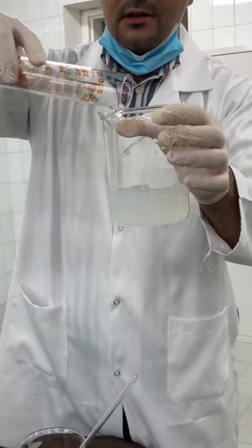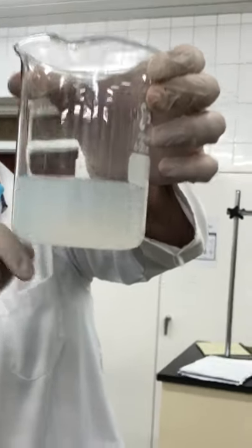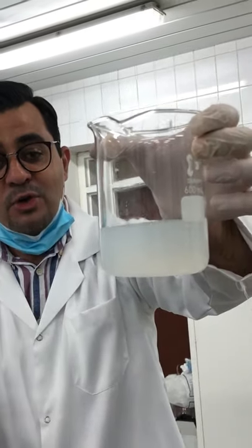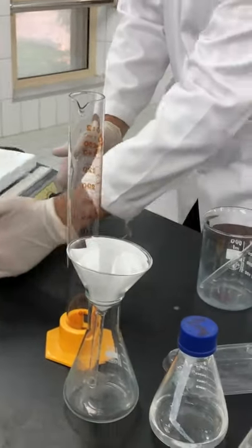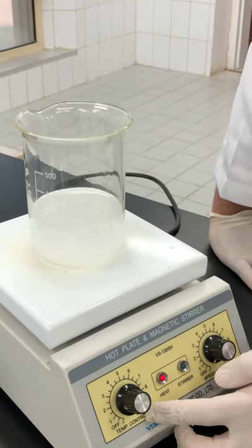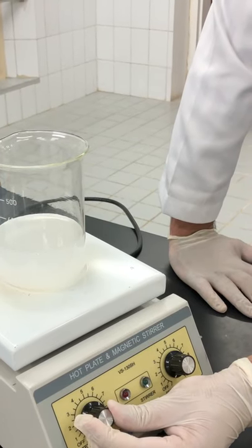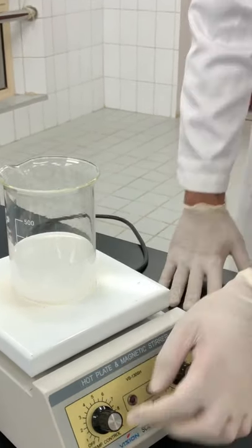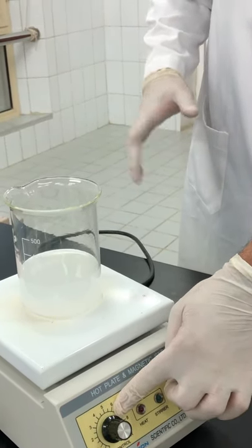I add water gently. You can see the formation of cloudiness — this white precipitate — which means the reaction immediately takes place. To make it faster, I put the reaction mixture on the hot plate. I set the heating level between 5 and 6, which means the temperature will not exceed 80 degrees Celsius.